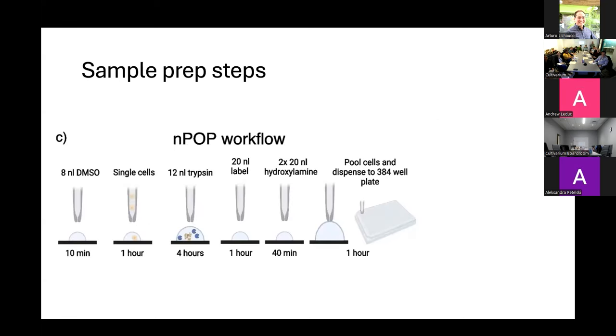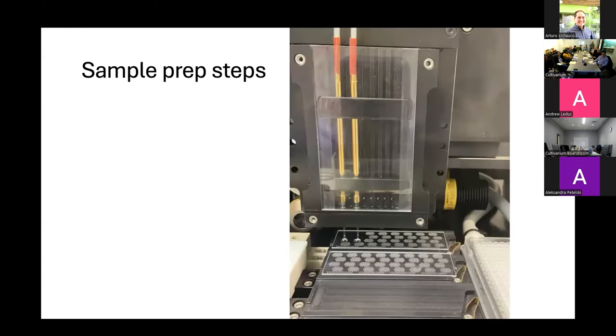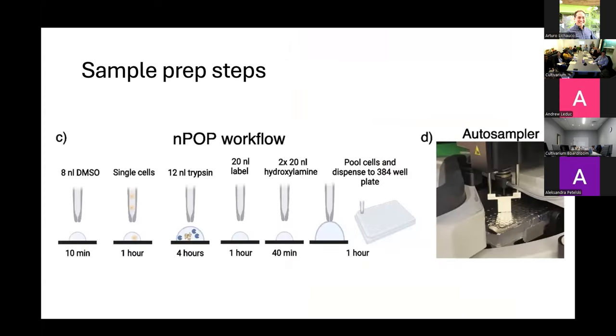And again, you've seen the workflow, and the last step was pooling samples and dispensing them into the plate. I'm not going to play this. You just watched this. Now that we've taken our samples, put them in the plate, and sealed it or dried it down for storage, waited a month, maybe our mass spec was broken, our mass spec is fixed, we're going to take the plate out of the freezer and rehydrate the samples in a microliter of DDM and 0.1% formic acid mix solution.